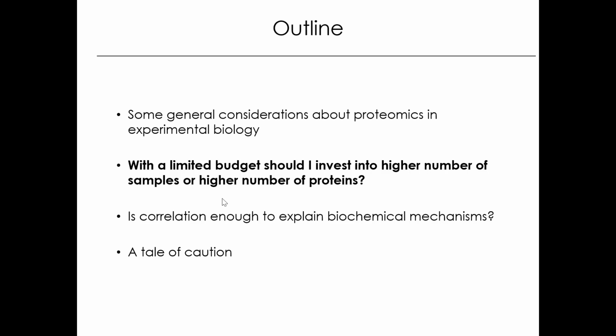And what I hope you appreciate, and it's a very short summary of this part, is that from a biological point of view, there are different objectives people want to achieve. Some have to do with discovering a specific protein that carries out a particular function. Others have to do with learning from the behavior of a cell. And for both of these approaches, broadly speaking, there are different methods that are optimally suited for this purpose. So it's not that one technique is better than the other. They simply serve different purposes. For the DIA method, we will not discover new proteins a priori, but we can see how these proteins behave quantitatively under various conditions.